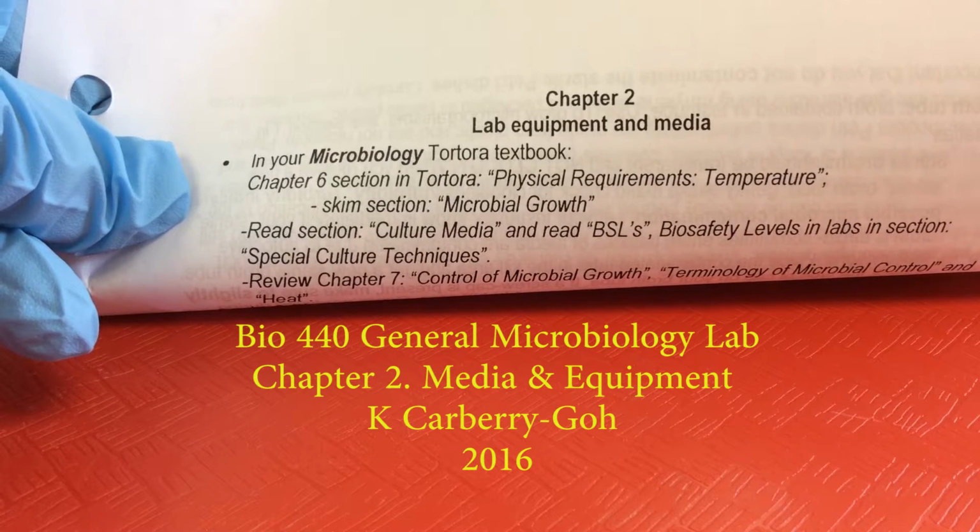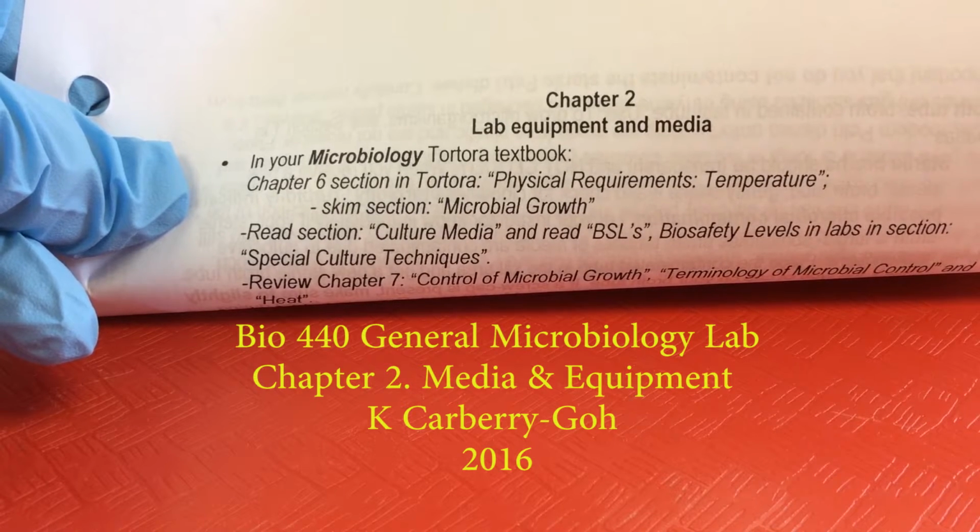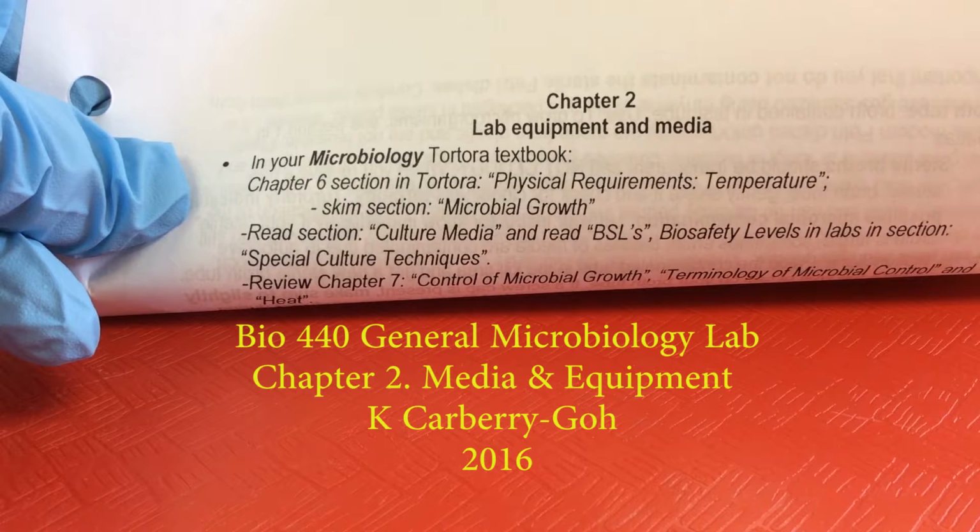Welcome. This is Sacramento City College Biology 440 General Microbiology Lab. This video is going to cover information in Chapter 2 of our lab manual, lab equipment and media.